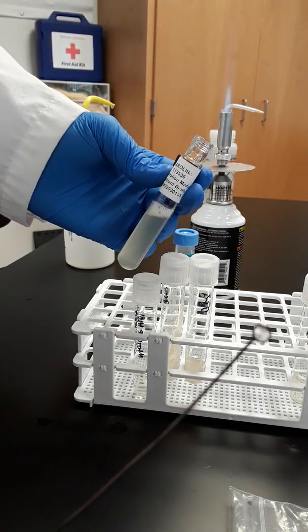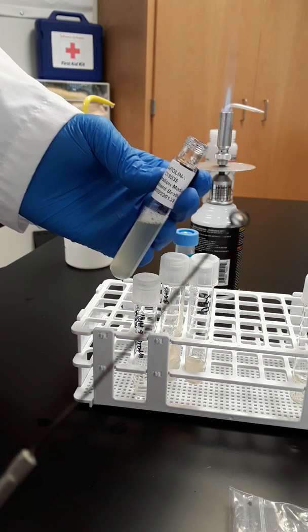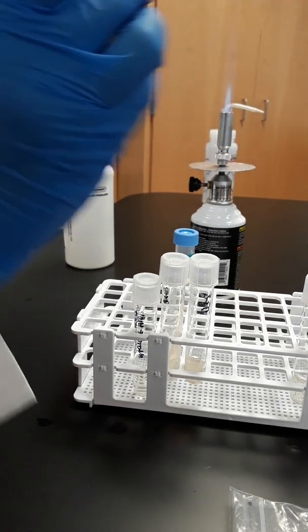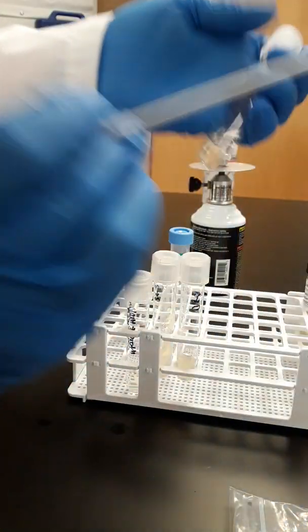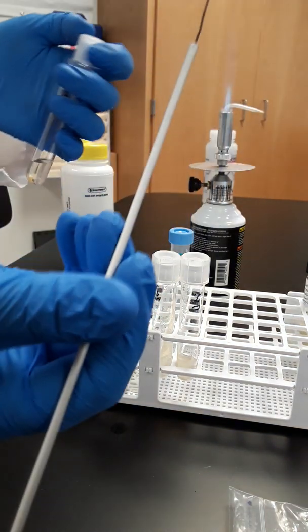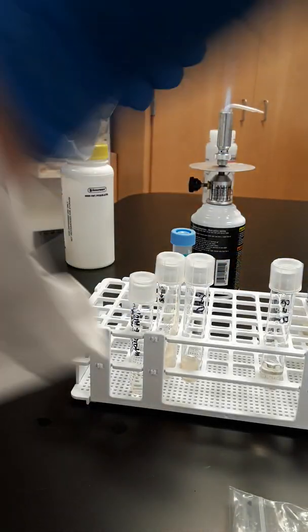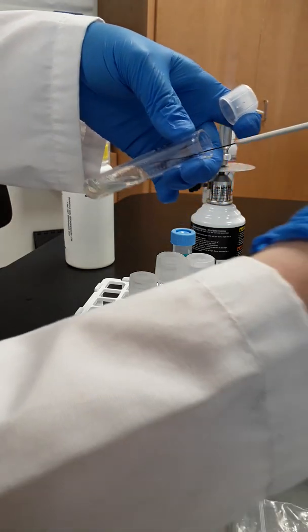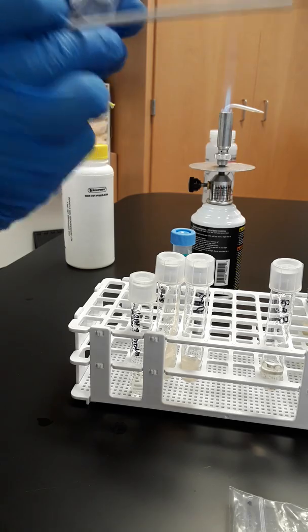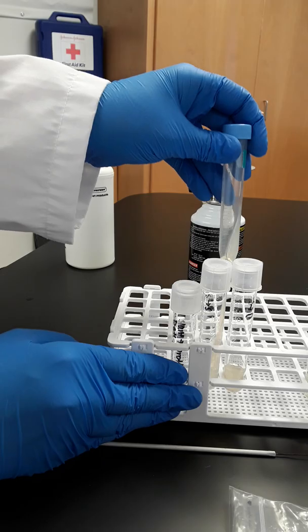And then I hope you can see that there's a little bit of opaqueness right there, like that shininess. That's the liquid. It's now in the loop. So that's where the cells are. Flame, flame, flame, flame. And then to inoculate this into the broth, you just put it in and twirl, and then you would sterilize again, inoculate again, and for the slant, it's the exact same thing. You would just dip it in and drag all the way up with a wiggle, and that is how you do that lab.